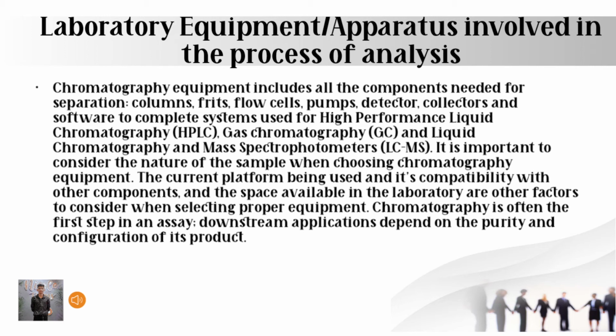Chromatography equipment includes all the components needed for separation: columns, frits, flow cells, pumps, detectors, collectors, and software to complete systems used for high-performance liquid chromatography or HPLC, gas chromatography or GC, and liquid chromatography mass spectrometers, LC-MS.